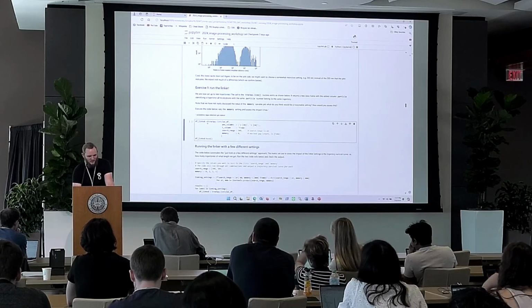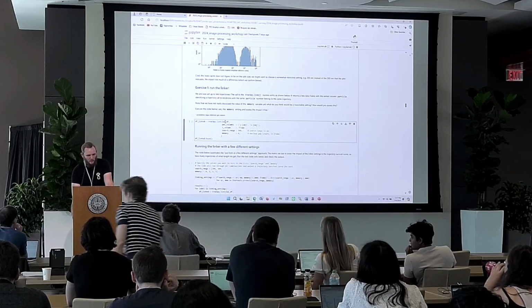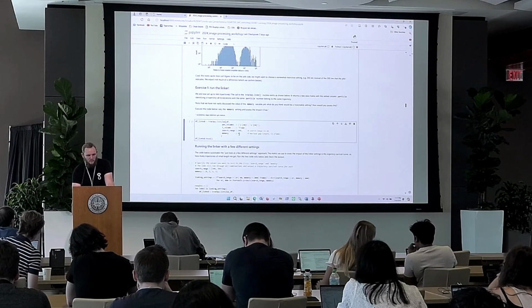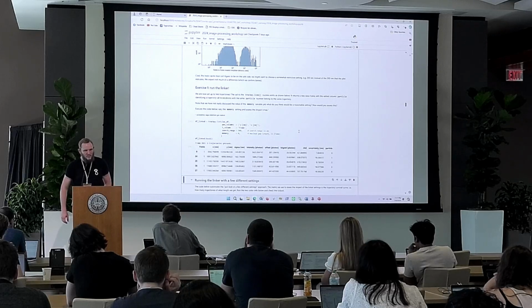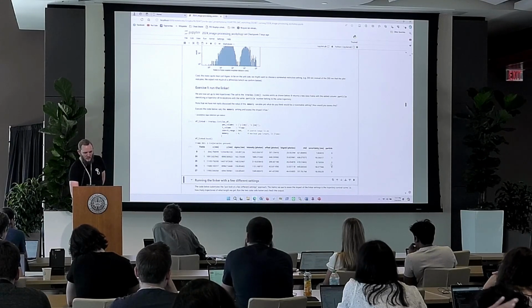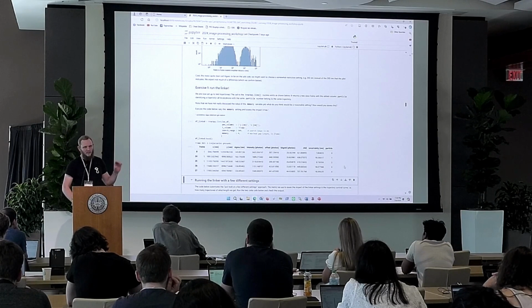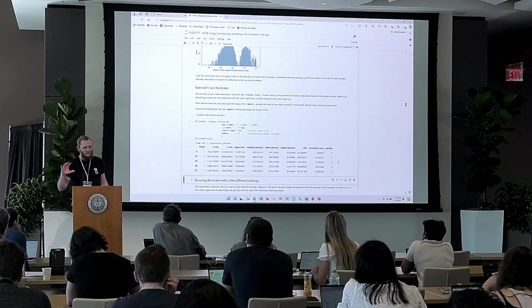This is, as promised, the one library call, trackpy.link. We give it the data frame with the localizations that we loaded from file. We tell it where to find the positions for the particle and which column in the data frame indicates time. And then it has these two parameters that I've been talking about. You just run this, and it spits out a data frame that looks like this, where now you have an added column that identifies particles. Because this is the head of the data frame, we're always in frame 1, so all the localizations are different particles. The localizations in subsequent frames will now also have some particle ID associated, and all the localizations with the same ID belong to the same particle.